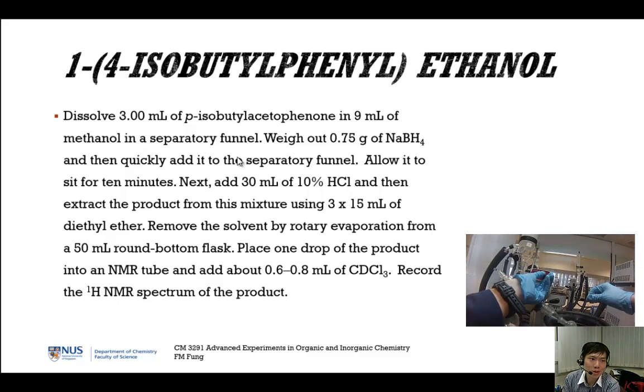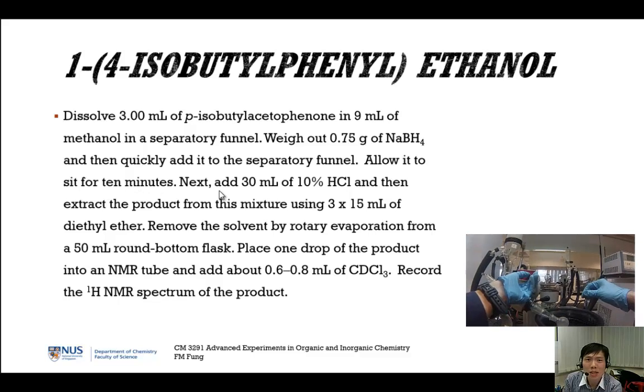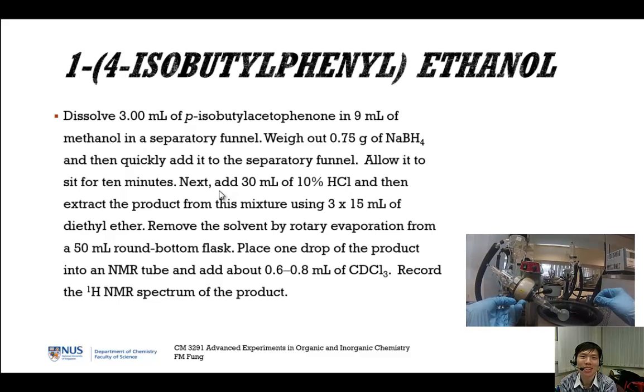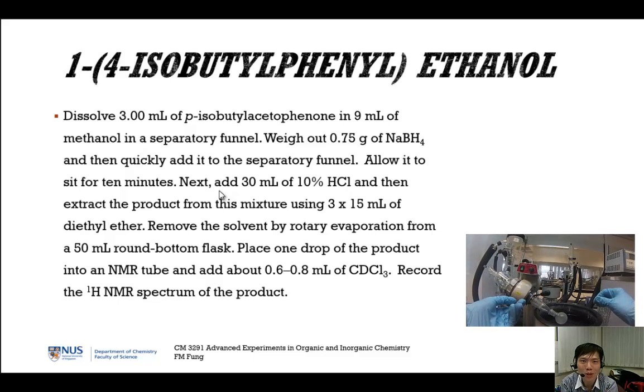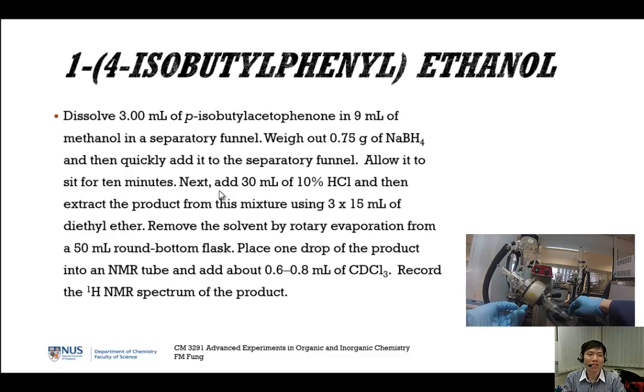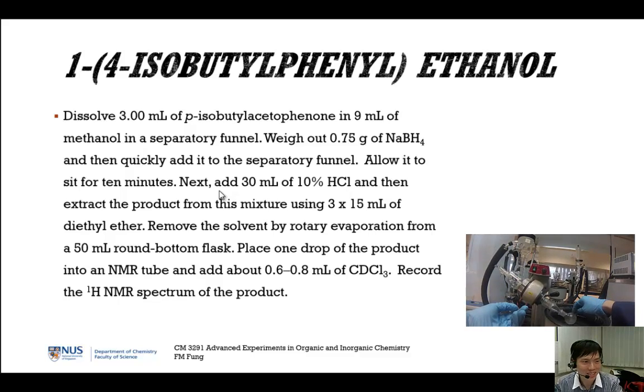Now, the lab manual says 10 minutes. These are the numbers that you should be judgmental about when you're doing the reactions in the lab, because it's not "10 minutes, okay, time's up, I'll stop it and go." You have to monitor reactions. Some reactions finish slightly under 10, some will take more time. It really depends. It's not like everybody will just take 10 minutes and get a high yield, okay?